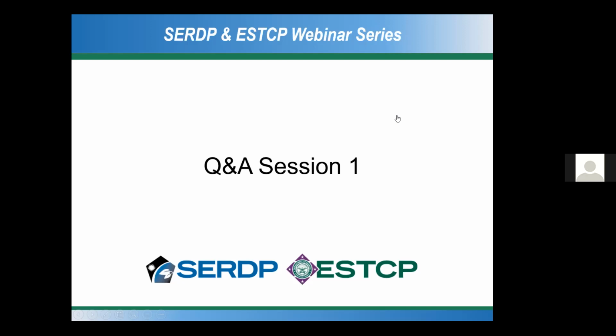And David, is this 14C assay available for use at other sites beyond this SERDP project? Yes, it is. We are partnering with Microbial Insights to make the assay available, and we have one pretty good success story with a client who did the assay and then was able to use the information from the assay to go to regulators and say, the rate constants that were observed in the laboratory study are consistent with the rate constants that we're observing in monitoring wells, and the assay is providing evidence that degradation products are forming.